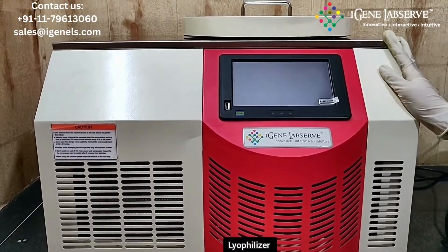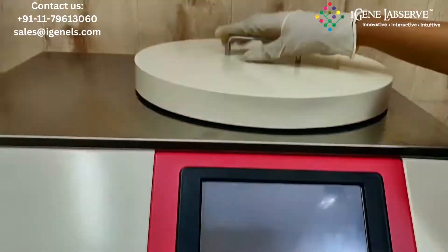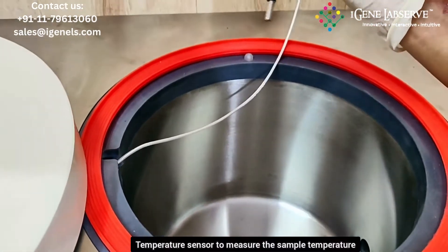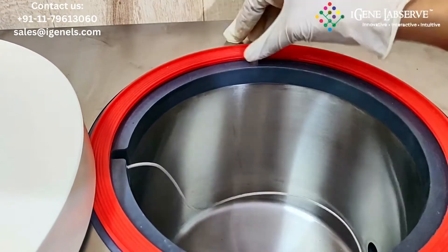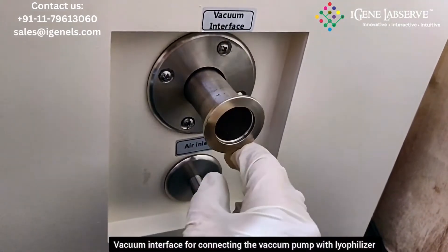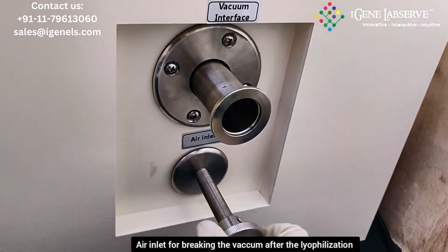This is iChin's lyophilizer. It has a large touchscreen display. This is the lid of the cold trap, and this here is the cold trap. It has a temperature sensor for measuring the sample temperature. This is the sealing ring. Here it has a vacuum interface for connecting the vacuum pump with the lyophilizer, and this is the air inlet for breaking the vacuum once the lyophilization is done.